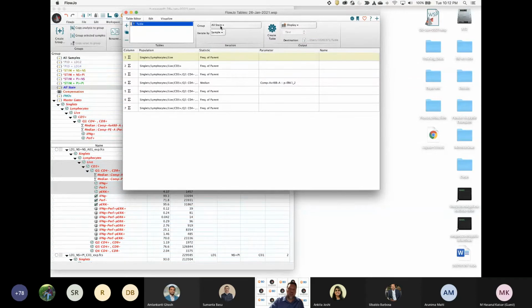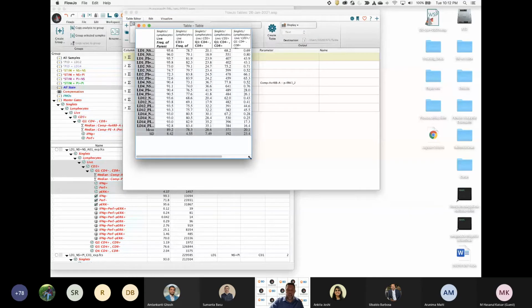And like the layout editor, it goes through the group of samples that you specify here, and you can choose different groups to focus your report on a subset of samples by sample and show this set of statistics in a displayed table, or you can choose to send this to a layout, the image, or to a file of your choosing, like a text file, a CSV, or an SQL database, whichever you need in this location. So I'm just going to show the display. That's usually what I do, create the table to display.